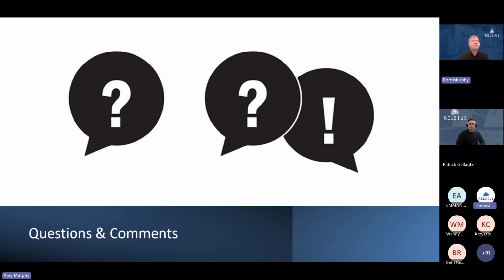Okay, thank you for that. This one from Helen, it might be a little bit similar to one of the first questions, but how often do you think mapping should be routinely performed on a large walk-in cold store? Again, that would be the same as the answer to the first question. So for a ULT freezer, a cold room, the recommendation is not longer than 2 years between mappings. A lot of people will map annually.